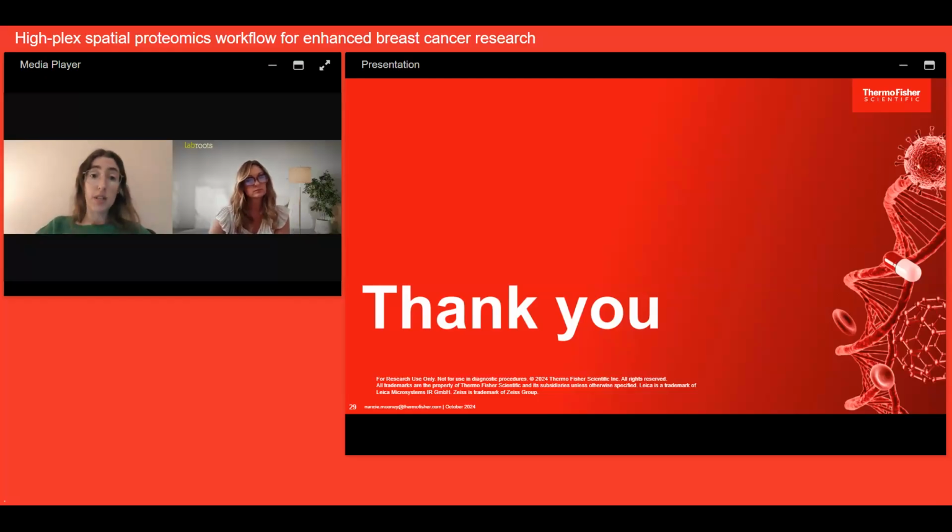If you're going to be using the Aluora dyes on something like an EVOS M7000 that's actually got more of the cube-based filters, all of those match to pretty standard fluors. So like Aluora 488, you use the GFP filter, and so forth. And that is all in not only the Aluora user guide, but I think we also will have that in Spectral Viewer and some of the other helpful guides in terms of how to match filters to the various fluors.